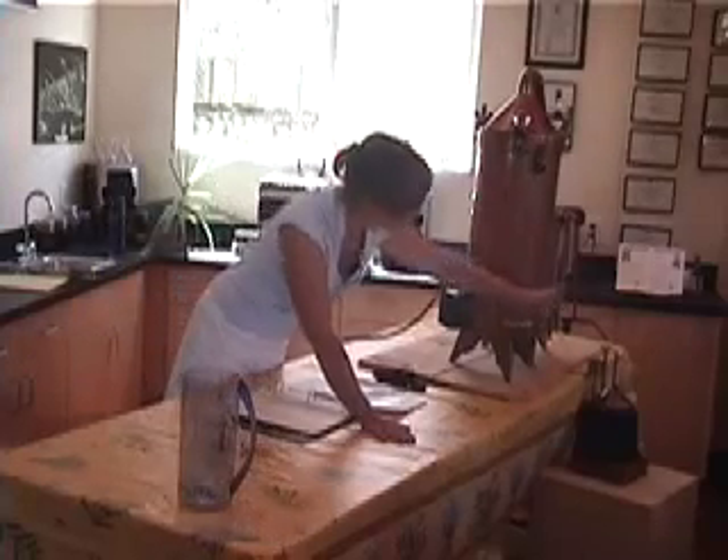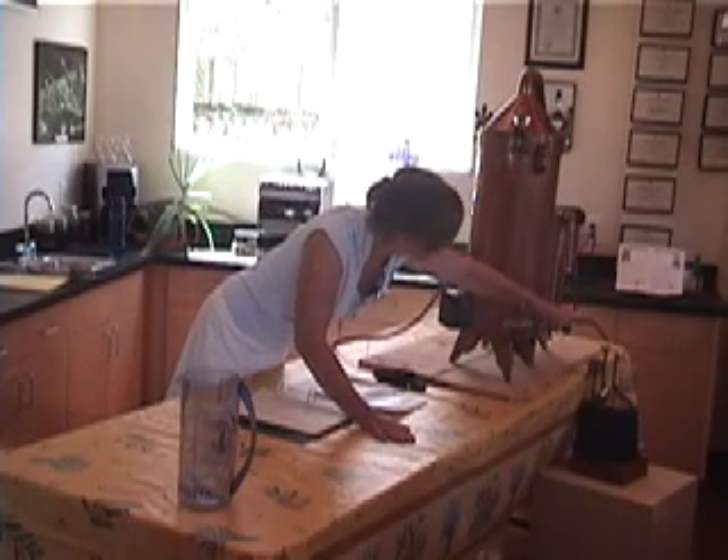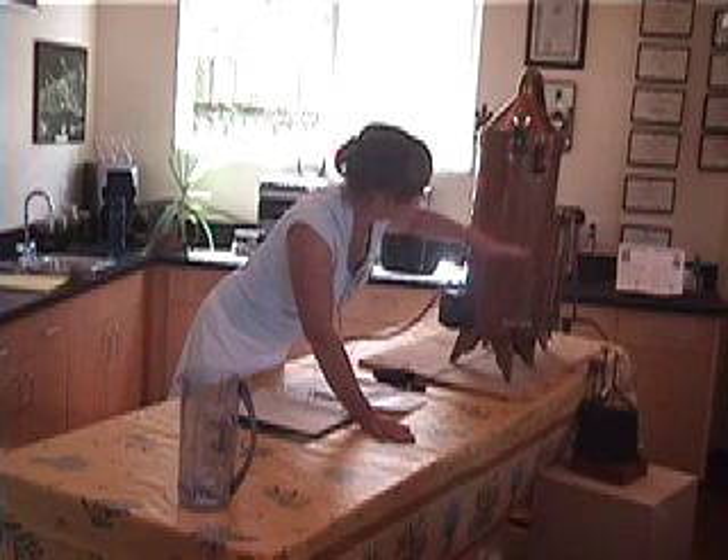I put water in here, and you'll see in my sight glass — see this glass here in the front — you can see the level of water. It should be about halfway. It doesn't mean that the water's up to here, but it indicates that the level is correct.